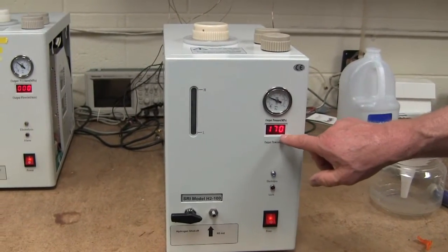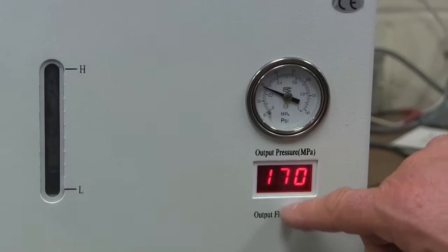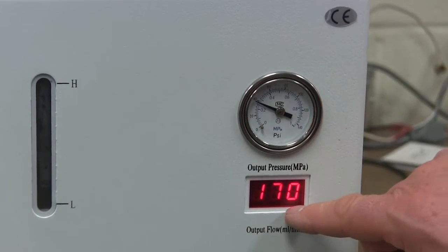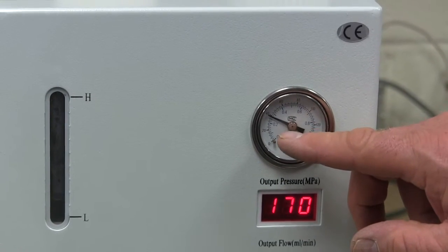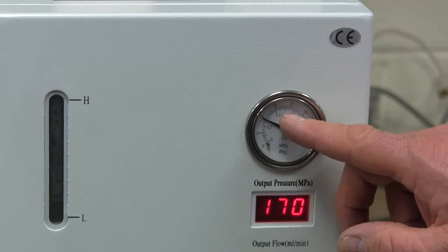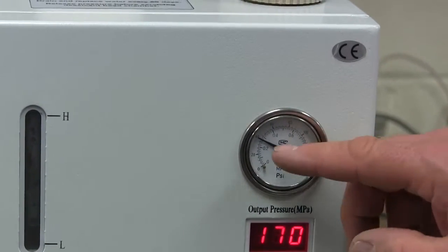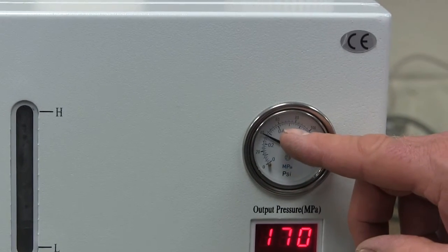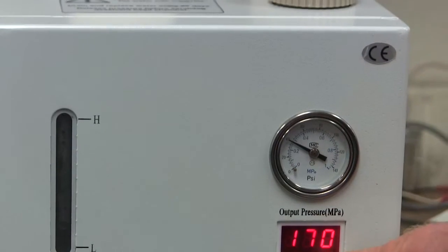So this display here on the front of the hydrogen generator shows how much hydrogen is being made. You can see it's 170, but as it gets close to the set point, the set point of the hydrogen generator is 60 psi. So they all pressurize up to 60 psi and then they stop. You'll see that when the needle gets closer to the 60 psi mark, this number drops to zero.